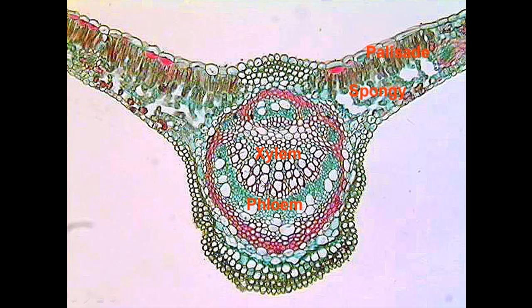Alright, so xylem, the large ones in here, phloem, some bundle sheath cells around the outside, or that sclerenchyma. Down the bottom here, possibly still a little bit more parenchyma, and then the last ones here that are a bit bigger with darker outlines are probably collenchyma again.